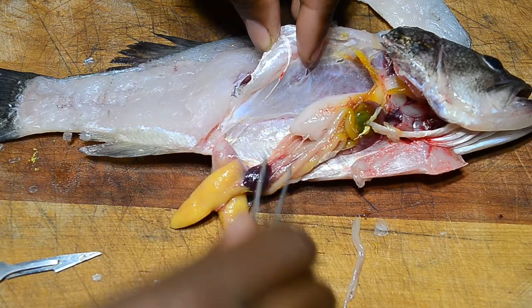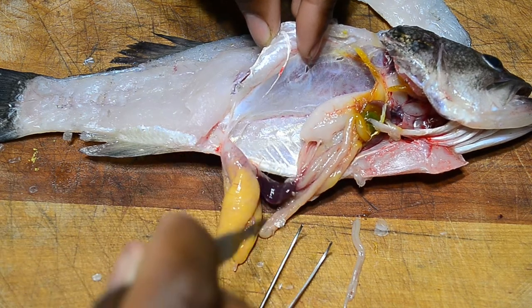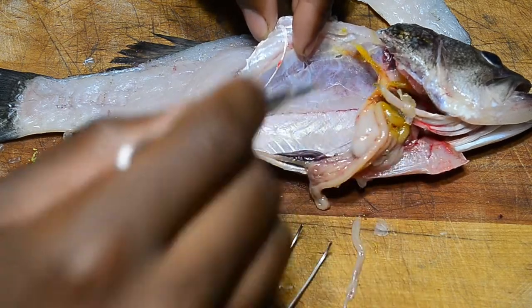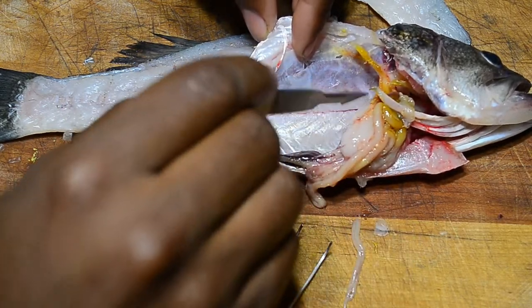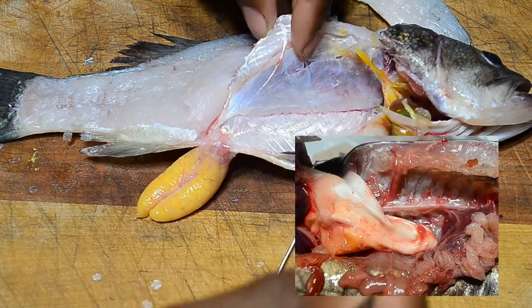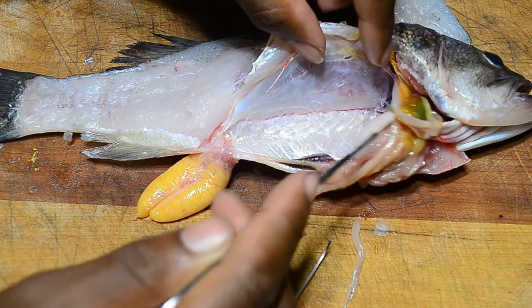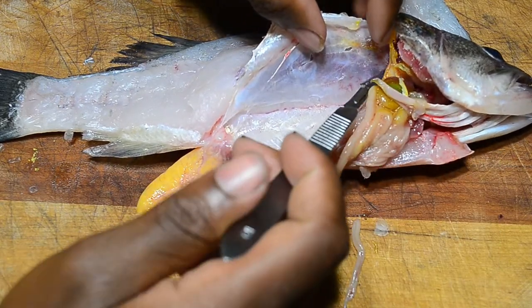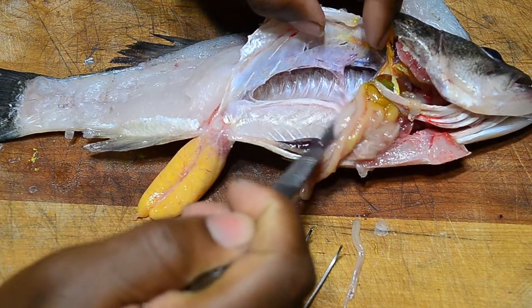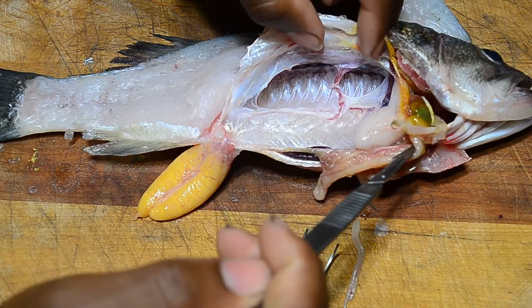Let's carefully remove these. Compared to the catfish where the air bladder was just one big bag-like section, here it's this whole upper section. If you cut open here it's just empty space full of air to help with buoyancy.